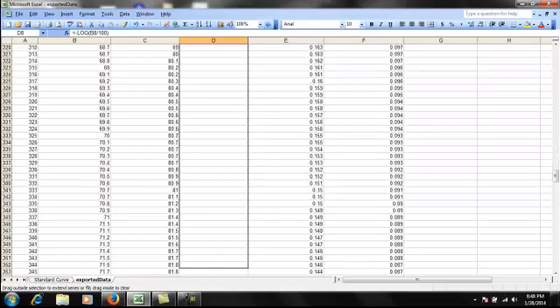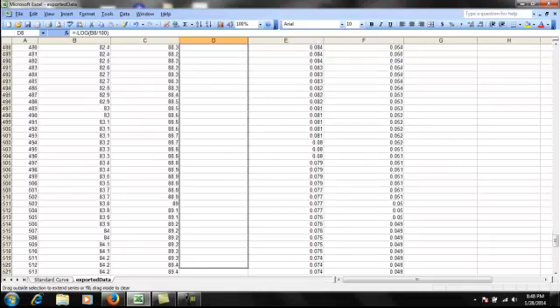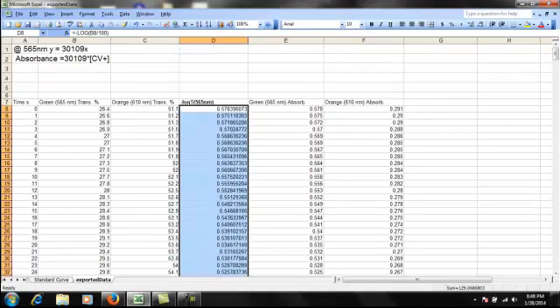And we're going down and going down. Notice here, I took like 500 and some odd data points the other day, and so this would be very tedious to calculate it all by hand, but with the power of spreadsheets, I can just make it fill down. And huzzah, there we go. Now, notice here, this also corresponds exactly to the absorbance measurement I have over there. So either way, it would give me the same thing, okay?